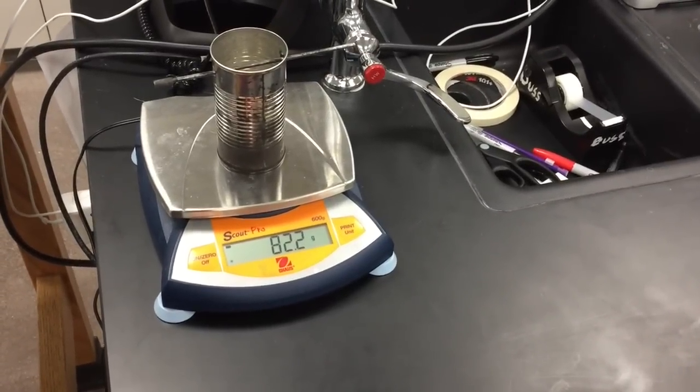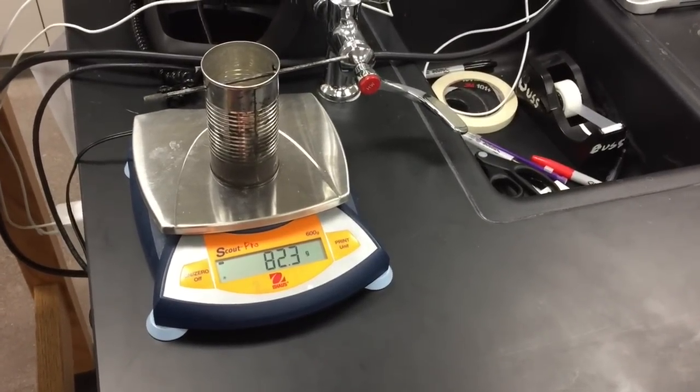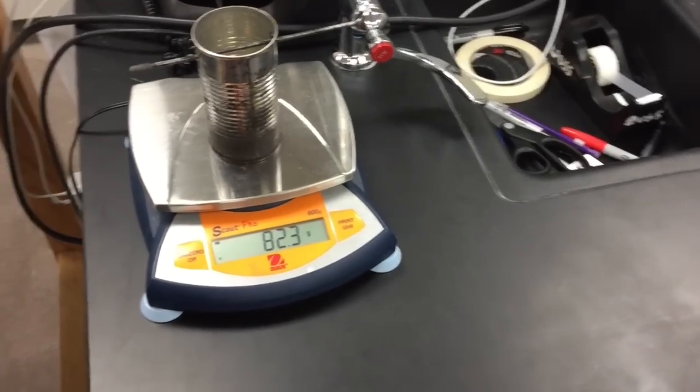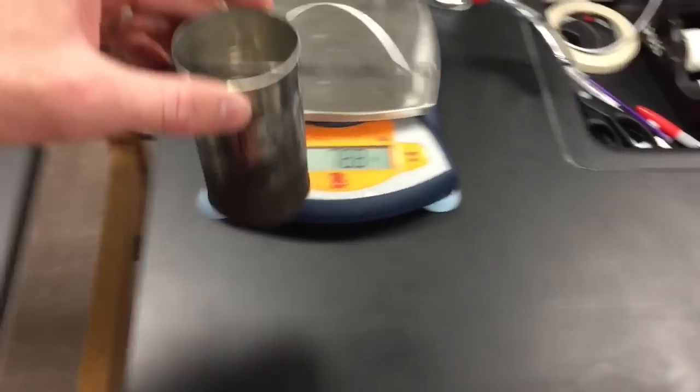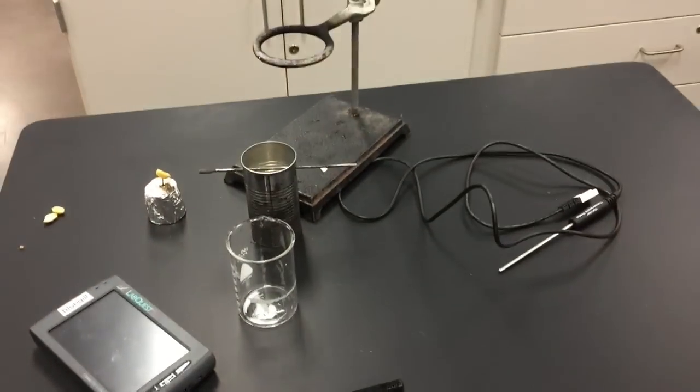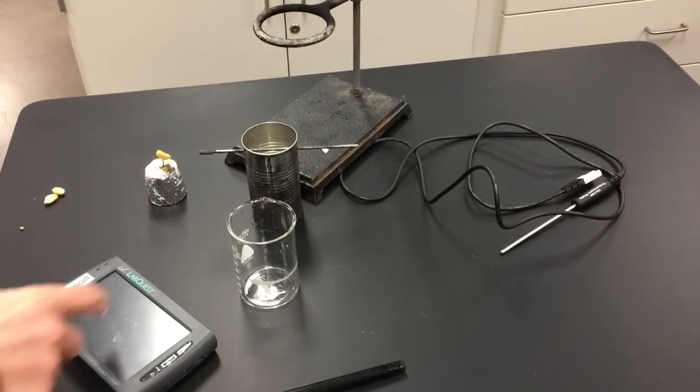Write down how much it weighs full, and then on your data table you just take the difference between what it weighs full and what it weighs empty, and that equals the weight of the water in grams. The last thing we need before we actually start the peanut on fire is what the temperature of the water is.